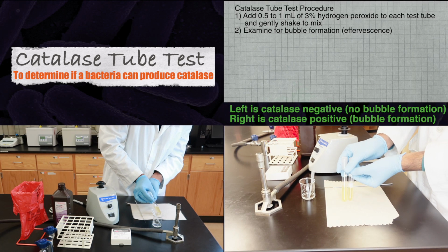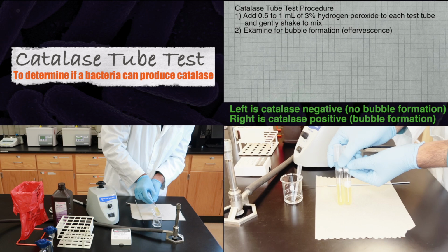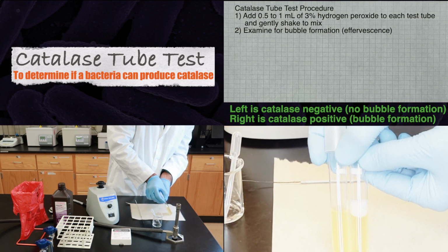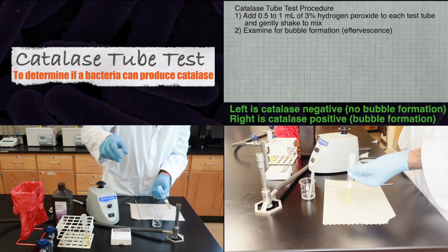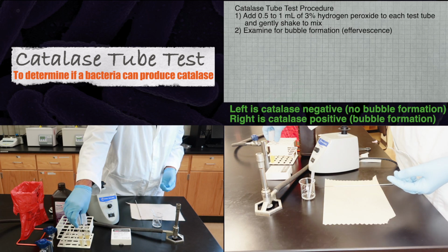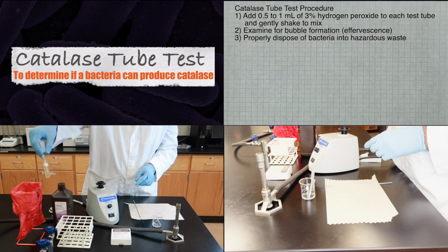Next, examine the tubes for bubble formation. In this example, on the left is catalase negative because there was no bubble formation, while on the right, the test tube is catalase positive because you can see bubble formation. Finally, please properly dispose of the bacteria cultures into the hazardous waste.